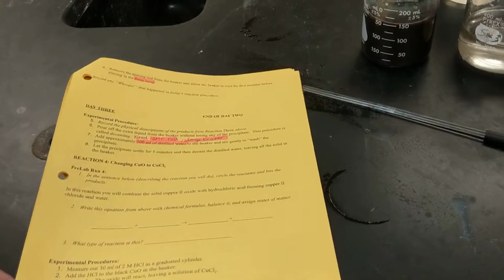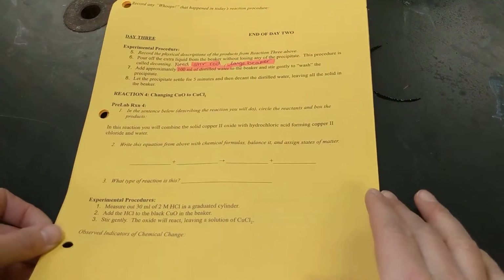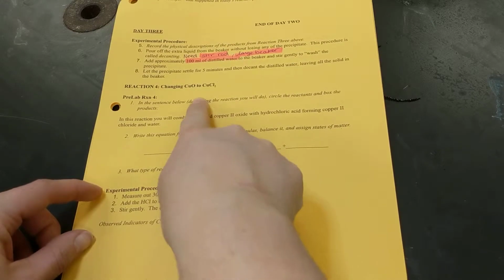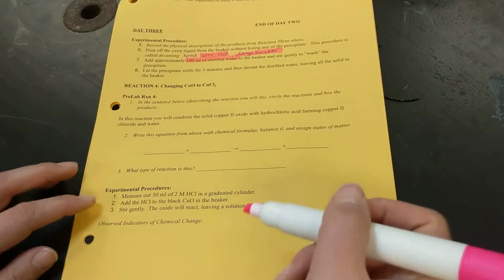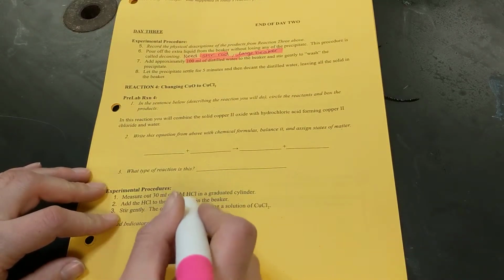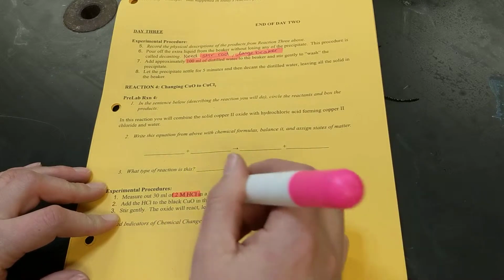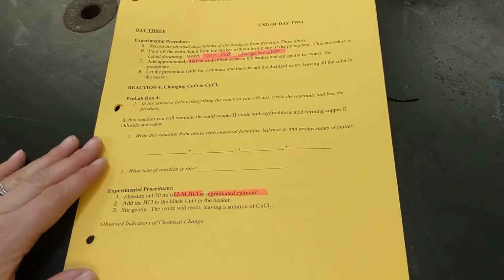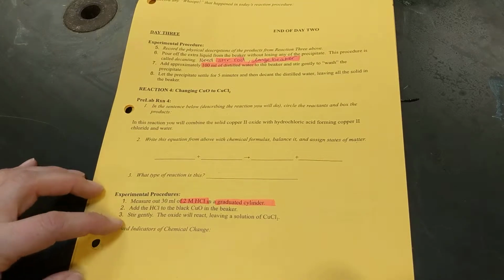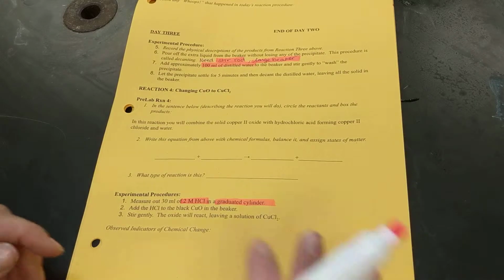The next steps of the lab ask us to actually do our reaction. So we're going to react our copper oxide, that black solid, with hydrochloric acid. It tells us we need to measure out 30 mL of 2 molar HCl in a graduated cylinder. So I need 2 molar hydrochloric acid and a graduated cylinder. It tells us we're going to add the hydrochloric acid to the black copper oxide in the beaker. Stir gently. The oxide will react, leaving a solution of copper 2 chloride.